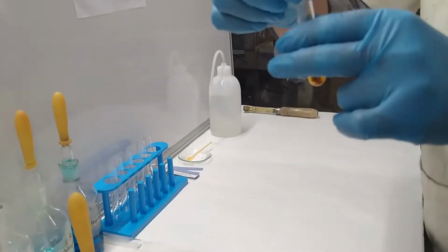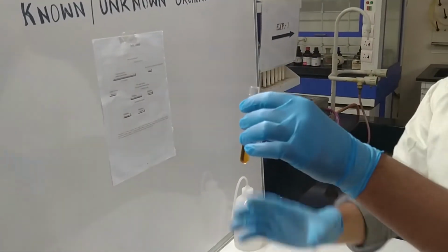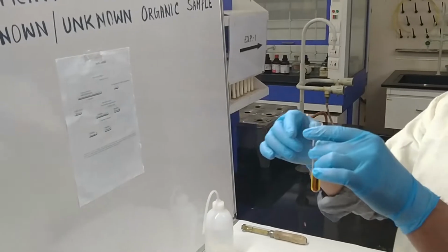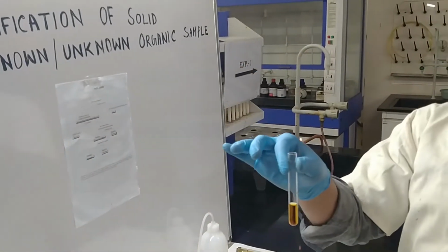So you can find no violet coloration over here. Okay, this is not violet. So no violet coloration means this is the negative observation of the glucose. Okay. So that means our I2 solution test is completed.